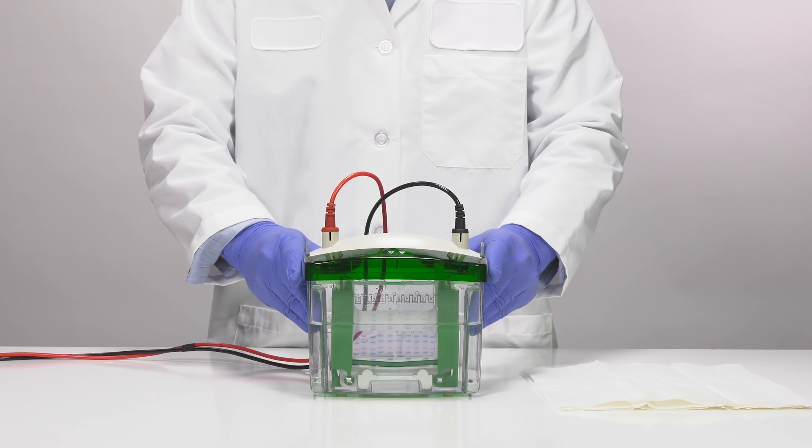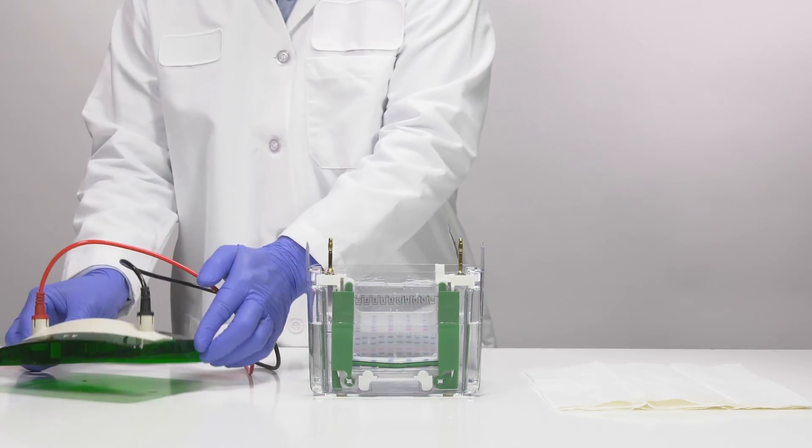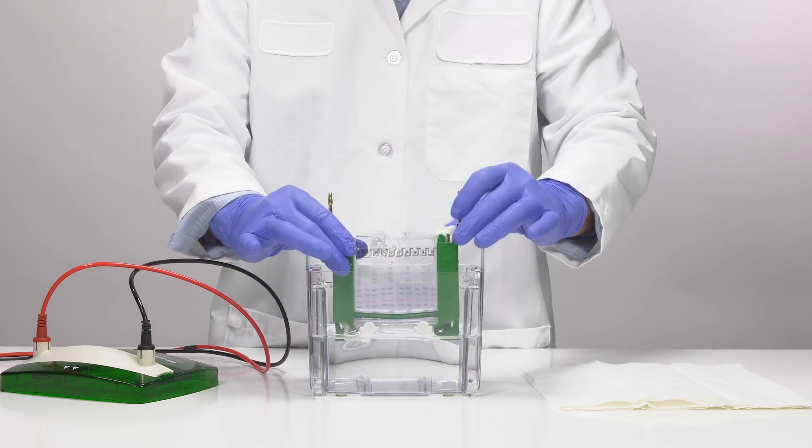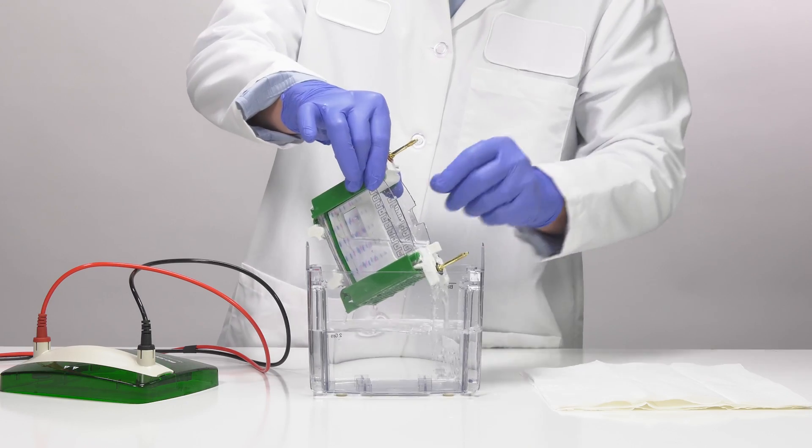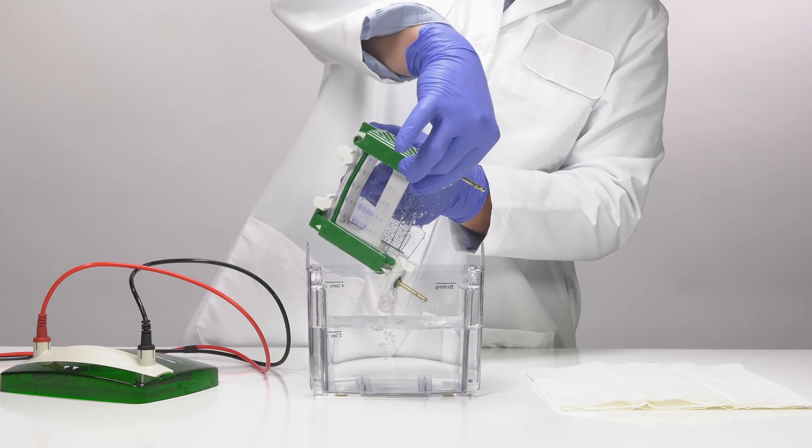Then turn off the power supply and remove the power leads from the electrophoresis tank. Pour the running buffer out of the core electrode assembly so you can remove the gel cassette from the tank.